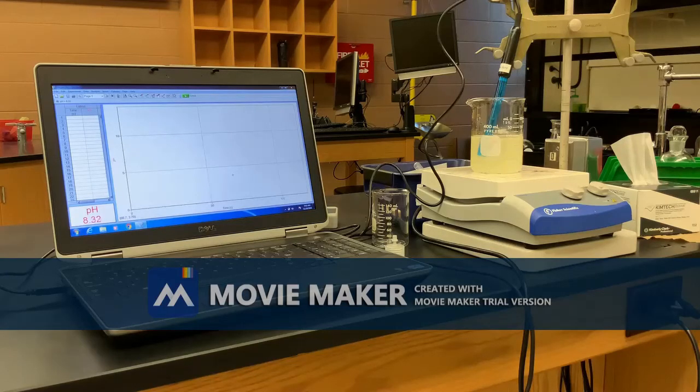So now I think we're seeing it go down. You've added 23 drops. Yes, it's going down. You've added 23 drops so far. Three drops, not 23.